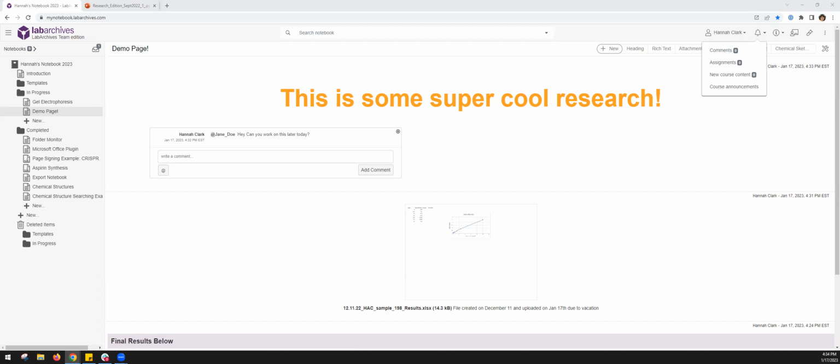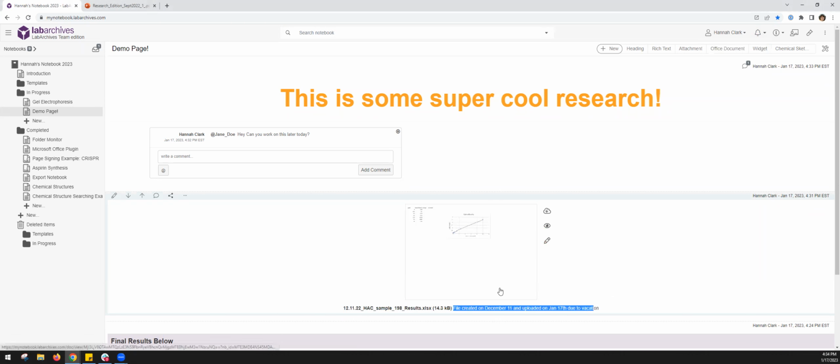Serena is asking, this is more a question regarding compliance to NIH requirements. When files are transferred to LabArchives retrospectively, the date/time will not be the actual date of the experiment. Will this still be accessible in terms of intellectual property? Is there any way to retain the real date of the file creation? Yep, so we did answer that one. Main method would be through description, things like that. But the date and time stamp that we have will always be the same. Also, the file should keep the creation and modification date. That depends on your operating system, the type, and how it's configured.